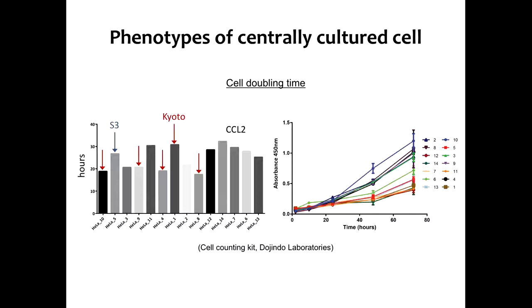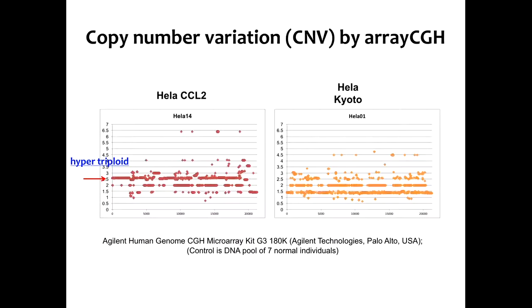So anyway, these cultures grew at different paces, and this is simply the representation of this graph in terms of doubling time. This is data from copy number variation. So each one of these cells has a genome, but the genomes are highly corrupted. These are tumor cells, and so there are translocations, there are deletions. In a normal cell, we would have basically a diploid state, except if it's a male cell, which this is not, where the Y chromosome would be in one copy. But for the other chromosomes, the autosomal chromosomes, you would have 2 copies per locus or chromosome.